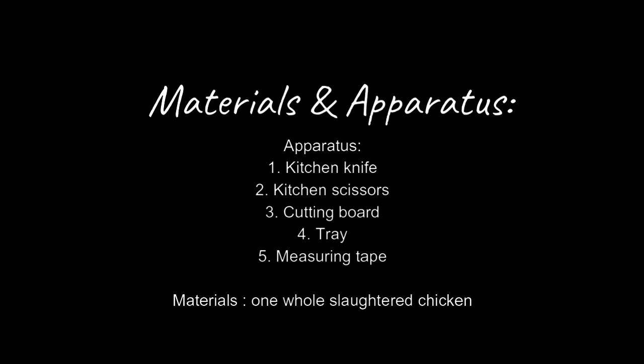For apparatus, we use a kitchen knife, kitchen scissors, cutting board, tray and measurement tape. For material, we use one whole slaughtered chicken.